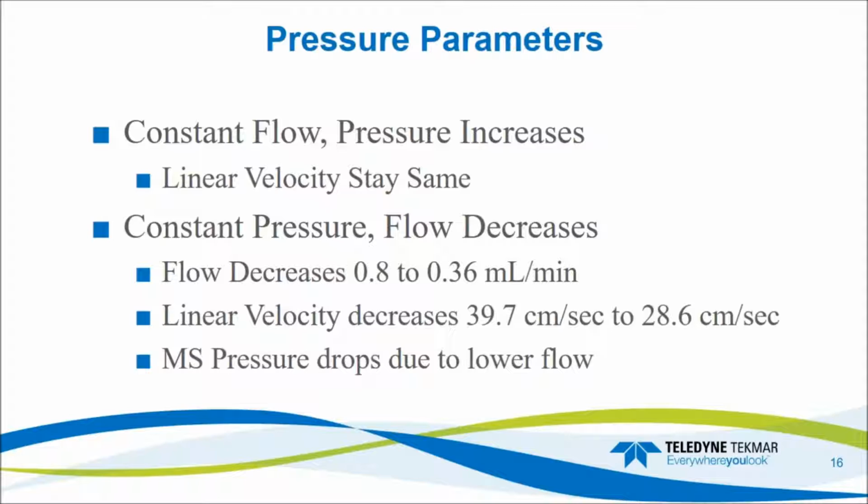The one thing we did notice too, and hadn't thought about this, was the mass spec pressure actually drops during the run due to that lower flow going into the mass spec.